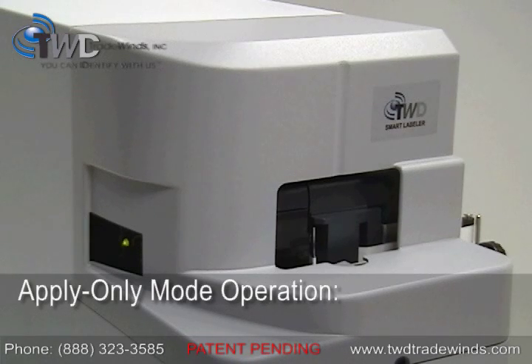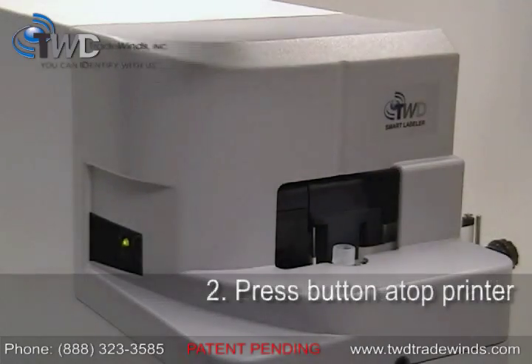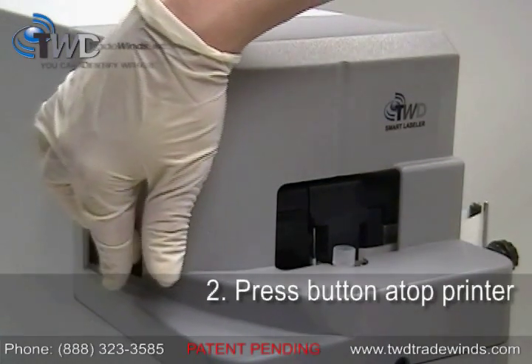In apply only mode, all that you need to do is place your labware into the labeling cradle and hit the button on the top of the printer. It's that easy.